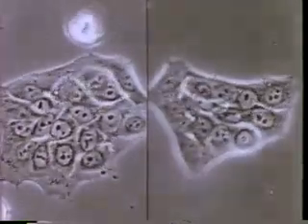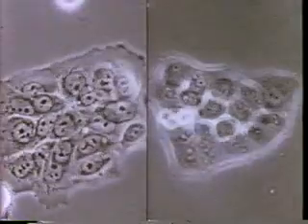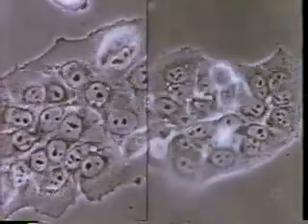Let's test this prediction in the laboratory. Here are two cultures of cancer cells. Those on the left have been treated with 5-fluorouracil. Compare the action of these cells to that of the untreated cells on the right.